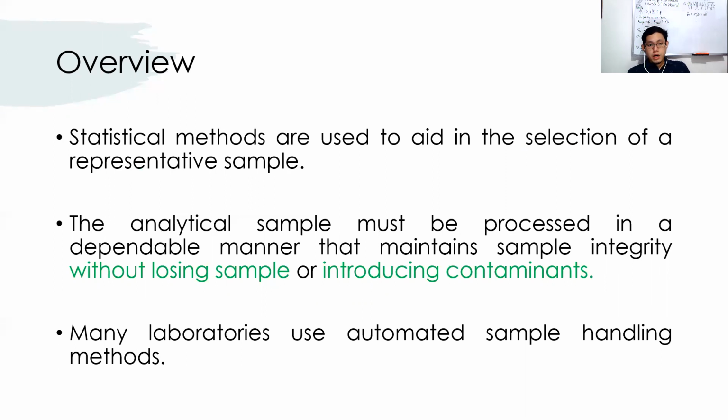So, unang cut mo pa lang dyan sa eggplant, pag na-expose yun sa air, ma-activate na agad yung kanyang polyphenol oxidase. So, yung polyphenol oxidase, nagbe-break siya ng iyong polyphenols, which can cause a reduction in your measured antioxidant values.